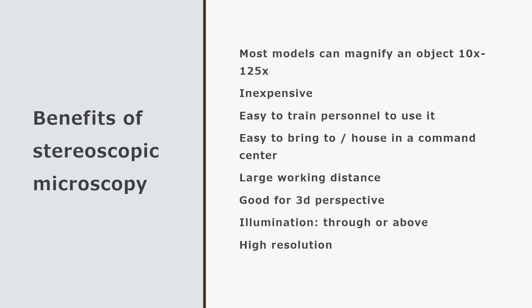So benefits, again, it is easy to train personnel to use it. It's very, very intuitive. It can magnify pretty well. I mean, it's not as good as a compound microscope, but you can still see a lot of detail. It's very inexpensive. These things are quite a bit less expensive typically than compound microscopes. You can't see quite as much. At least you can't zoom in quite as much. You can't get as much detail out of it necessarily, but that's okay. Sometimes that's the appropriate thing.